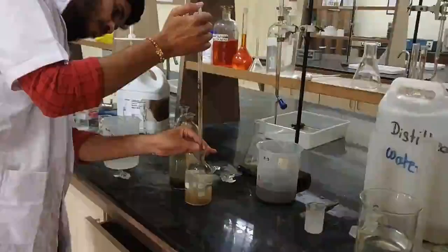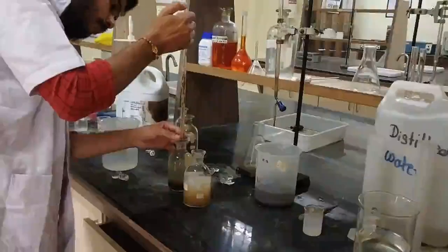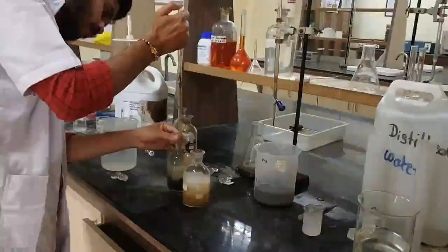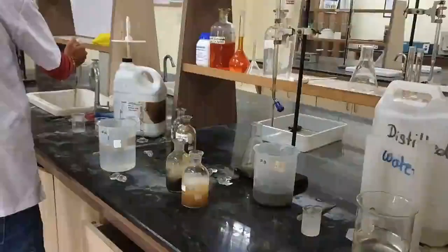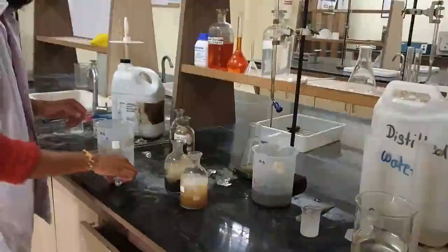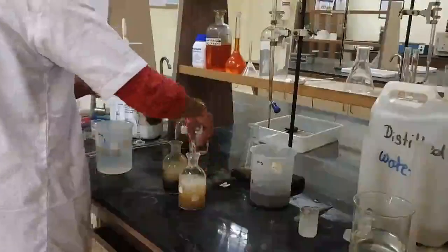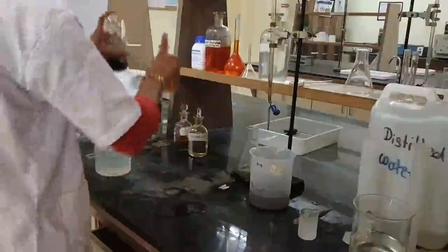Please see the change in the color that is happening after addition of alkali iodide azide. So first, in tap water you can see the yellowish or brownish PPT that is formed, and another bottle which has a very high organic concentration, you can see there is a whitish PPT that is formed. After putting the stopper, we'll be turning the bottles upside down properly with utmost care.